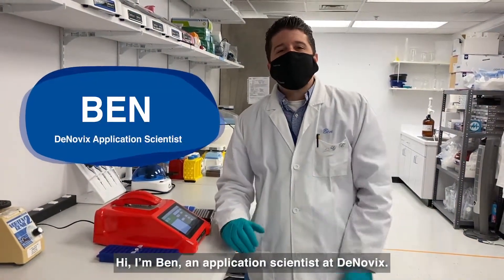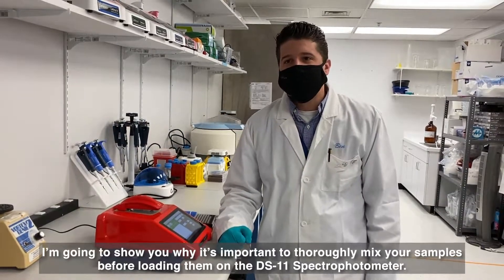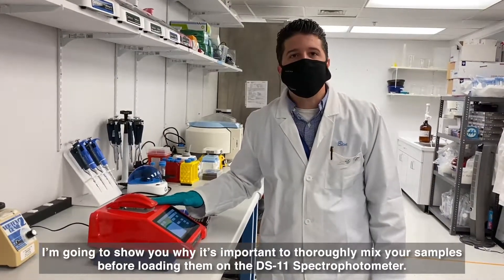Hi, I'm Ben, an application scientist at DeNovix, and I'm going to show you why it's important to thoroughly mix your samples before loading them on the DS11 spectrophotometer.